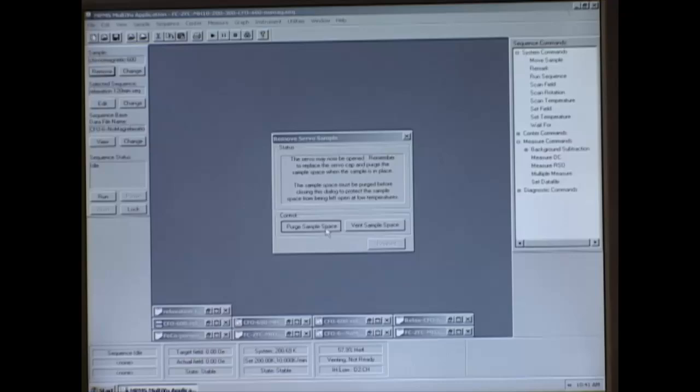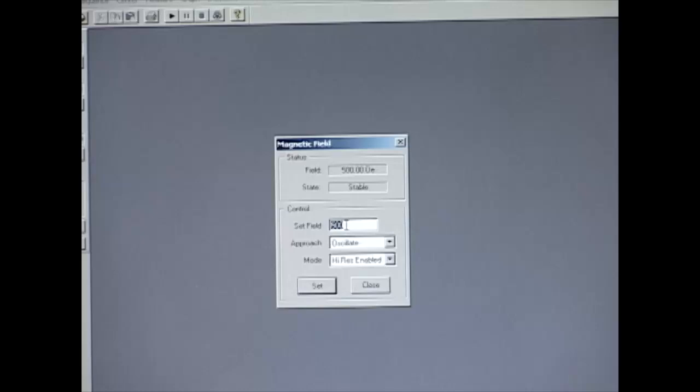Enter the sample name, mass, area, and length. Set the magnetic field to 500 Oersted. Initialize the transport to move the sample into the chamber.